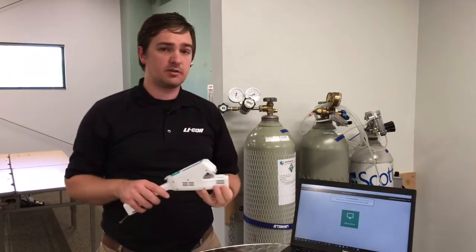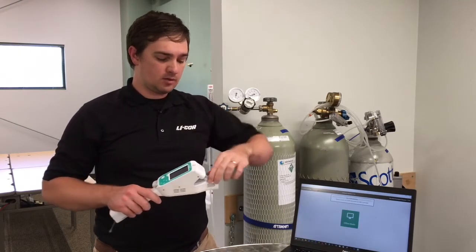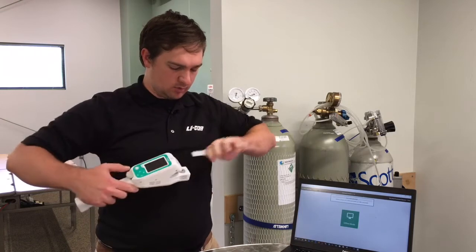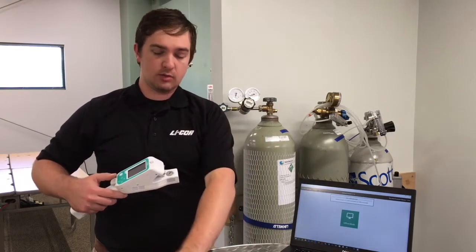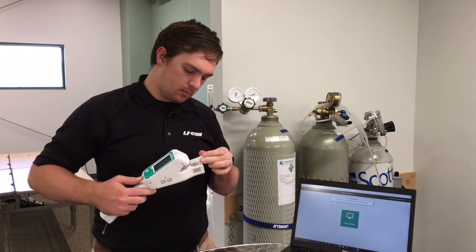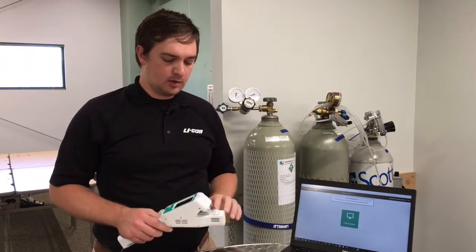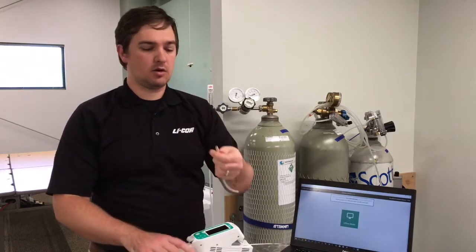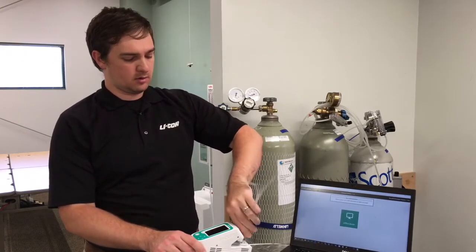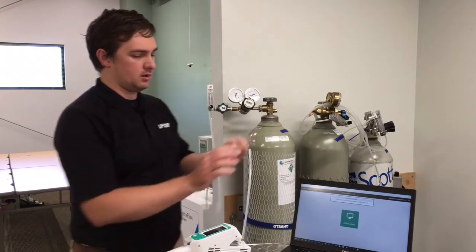As far as the instrument itself, the only hardware change you'll need to do is to remove the leaf clip by pulling it straight out. It might take some force, but it should pull straight out like that. Now you'll want to install the calibration clamp in the same way. And you should hear a click when it makes contact. Now we can put the 1032 hose barb into the calibration clamp itself and connect it to the tubing coming out of the tank using a quick connect fitting.